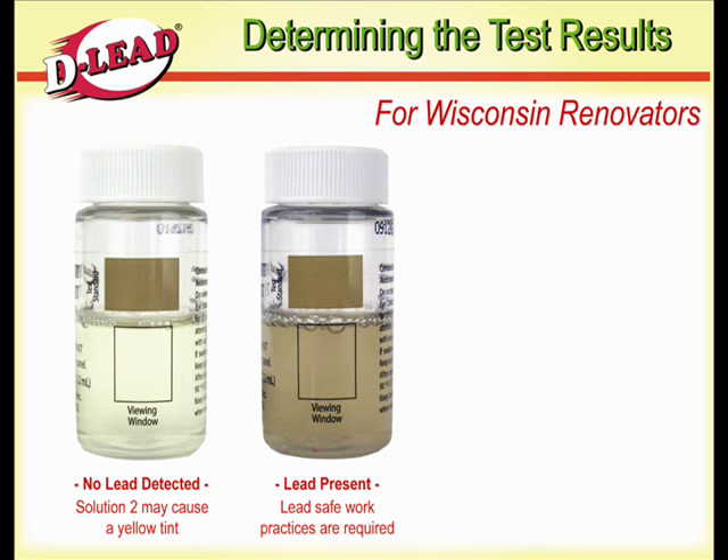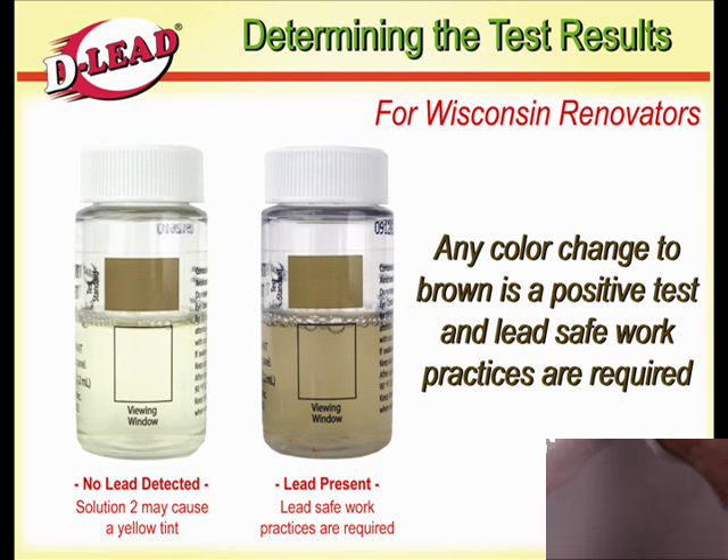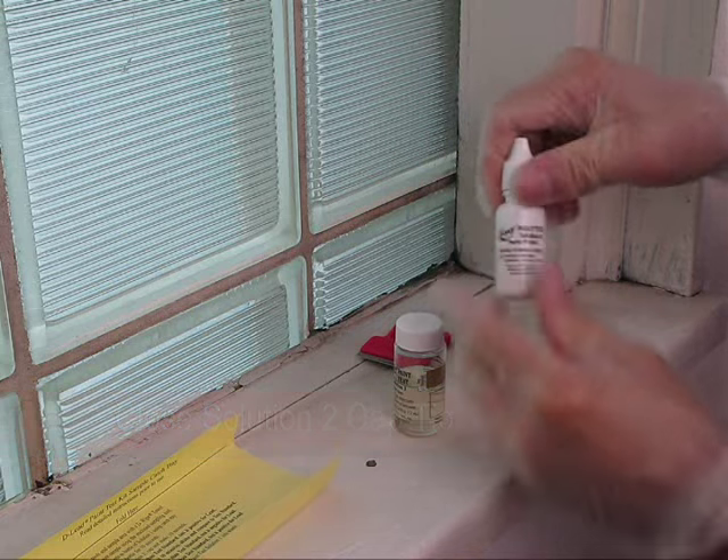For Wisconsin renovators, any color change to brown is a positive test and lead safe work practices are required. Make sure you tightly cap Solution 2 after each use.